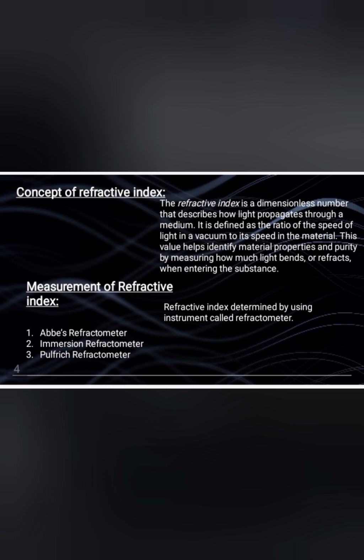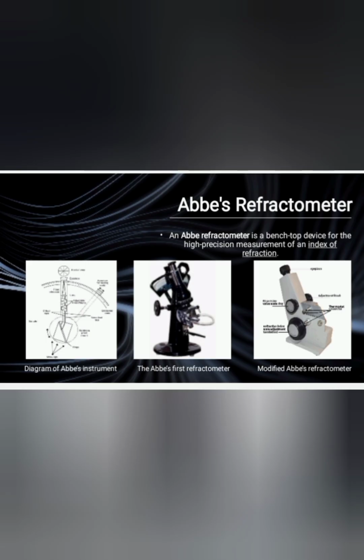Measurement of refractive index. Refractive index can be measured by three main instruments, that is Abbe's refractometer, immersion refractometer, and Pulfrich refractometer. Refractometer means an instrument that is used to measure refractive index. Abbe's refractometer. An Abbe's refractometer is a benchtop device for the high precision measurement of an index of refraction.